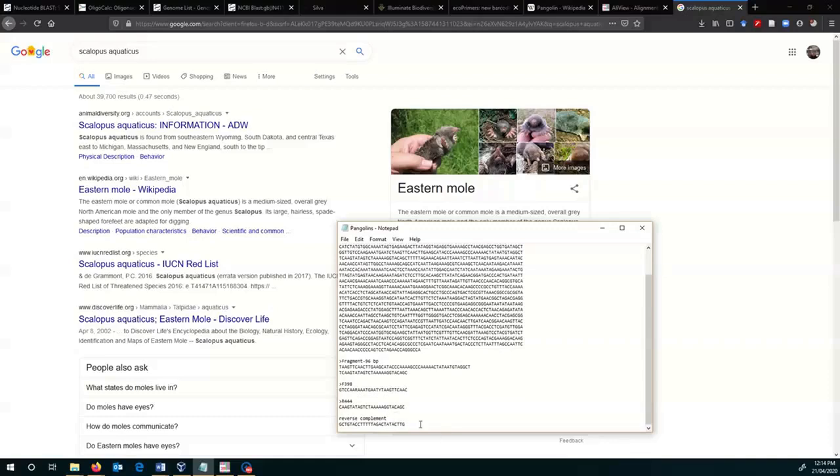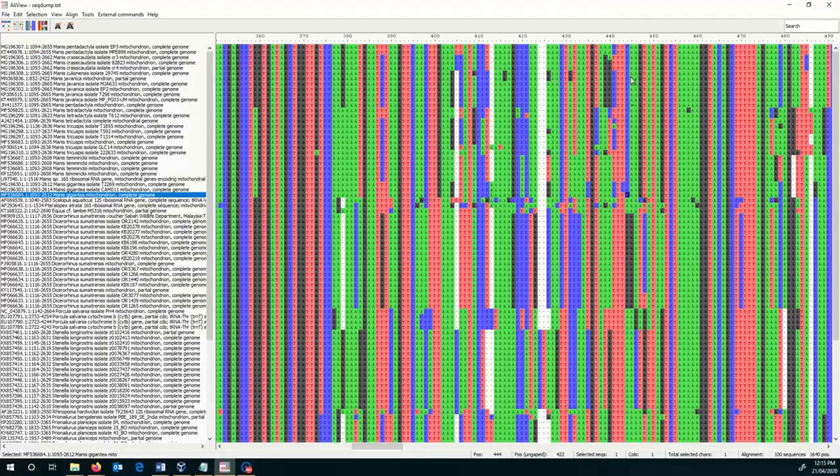So the C that was at the 3' end is actually on the other strand, it's a G. So now this is the 5' end of that. And what you're synthesizing, although it's binding to a C, it's the opposite because it's priming off the other strand, so it's a G. So it's reading it in reverse. So from 3' to 5', it would be G, T, T, because the T's bind to the A's, C to bind to this G, A to bind to this T, and so on up until here, which is where I designed the primer to bind to.